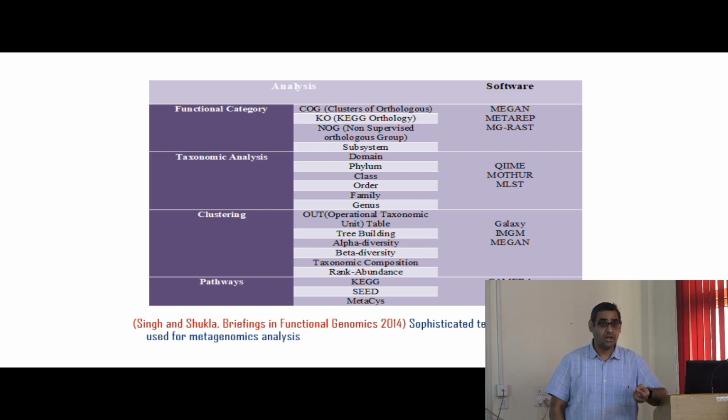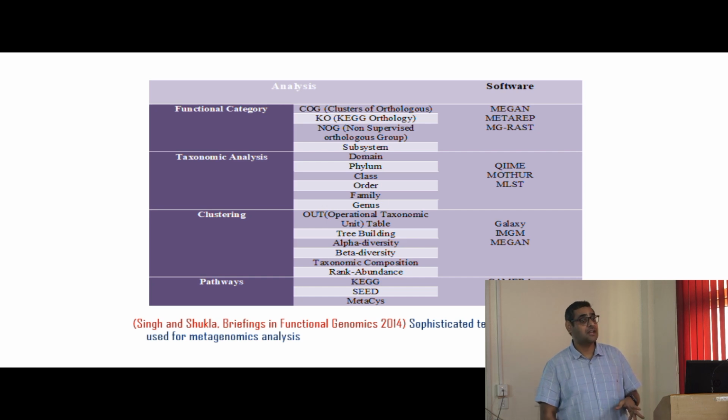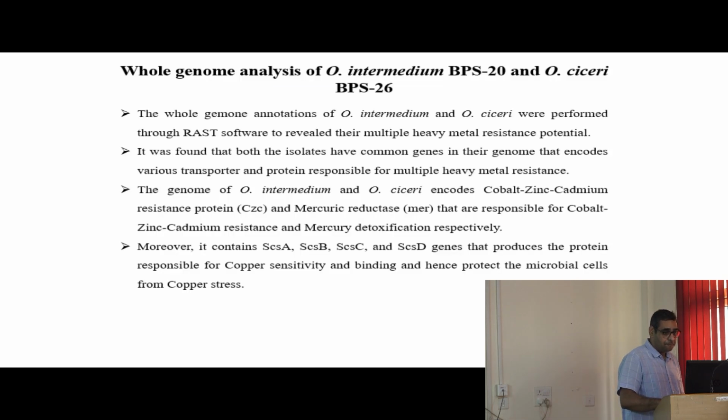Immunogenicity, immunological tolerance, the pathogenicity, specific receptors, all that is through various types of understanding and techniques. I suggest you use this software for your metagenomics data or general data, whatever you have, and try to learn it.